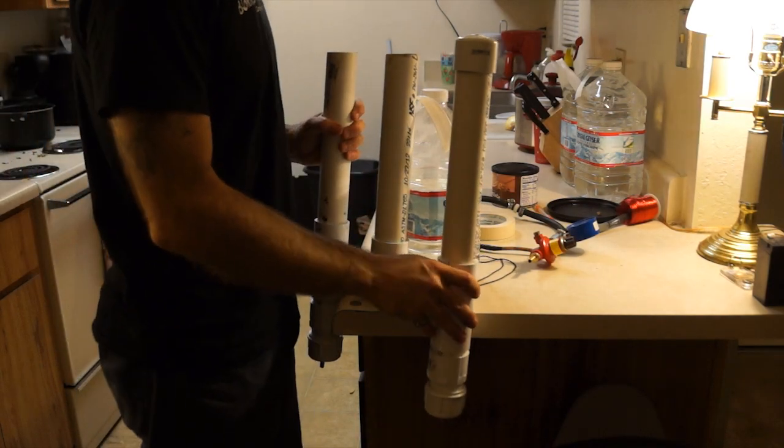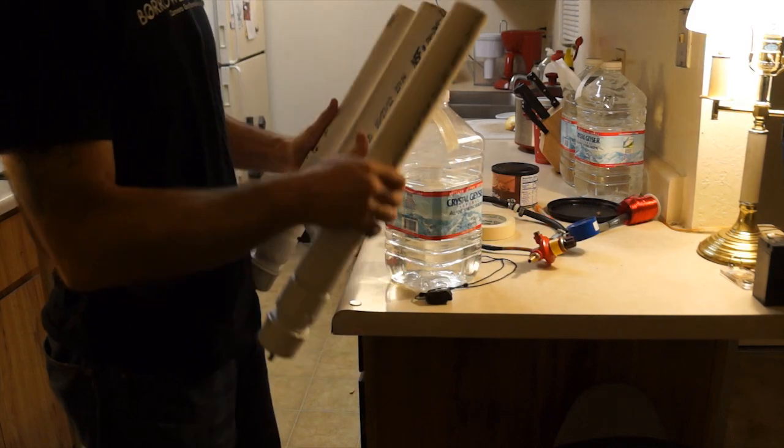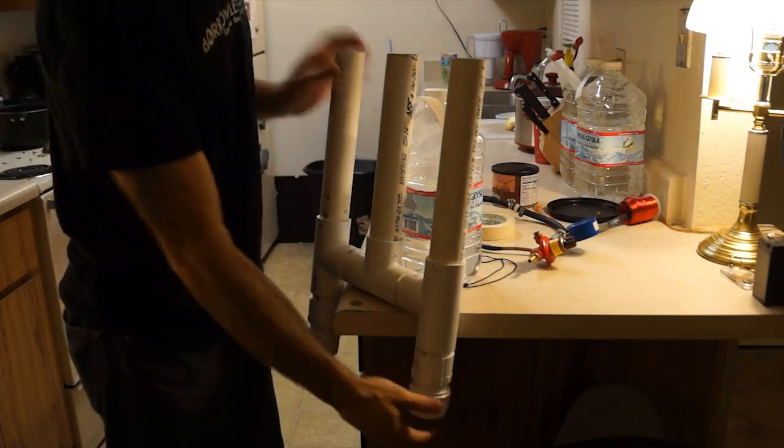All right, so this is my scaled-up Hoffman apparatus. As you can tell, there's three tubes here, some inch-and-a-half PVC.